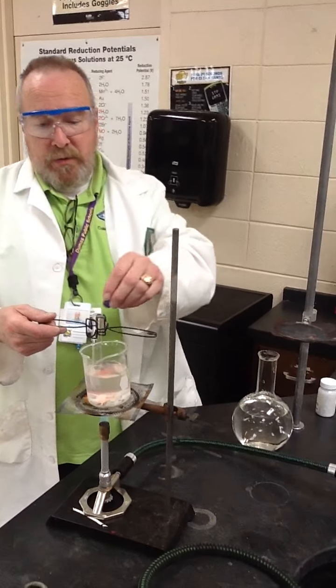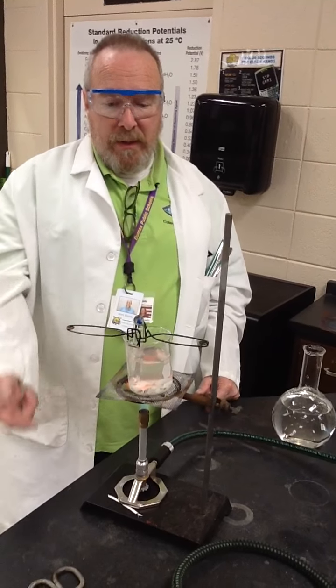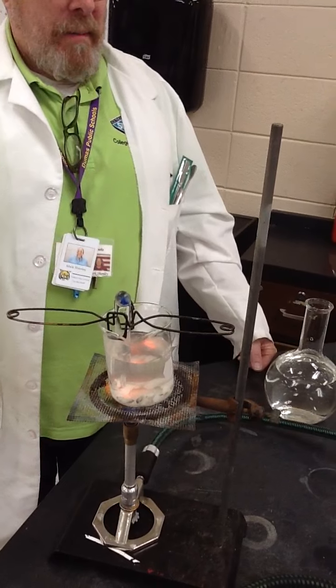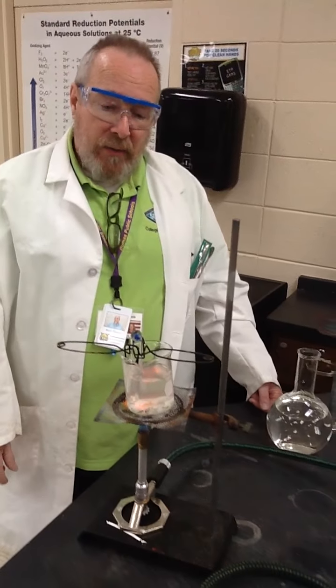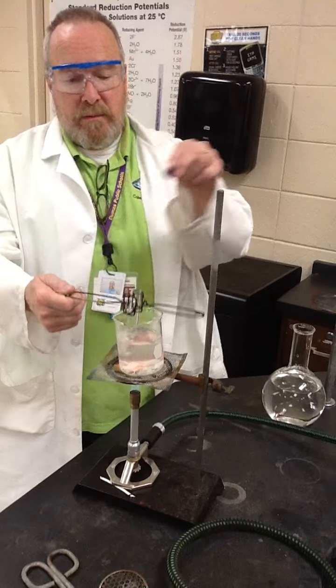One thing you can do is capture that by putting a marble on top, and that will allow the evaporating or boiling substance inside to condense on the marble and drip back down and save your volume of any sample inside.